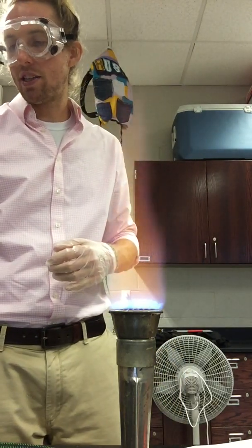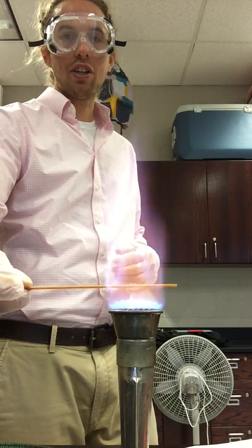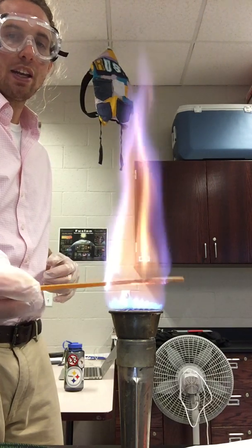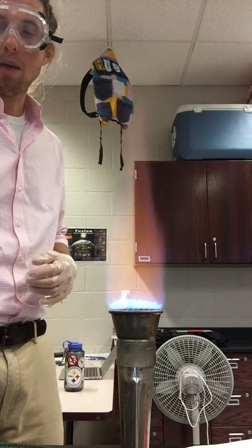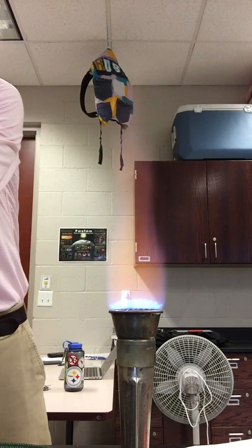So here is sample number 1. And we can see how that flame is changing. It's a bit hard to see. Maybe with that dark background you can see that's turning a bit violet in color. So again, kind of creative names, but it's maybe lavender, violet in color, and that is sample number 1. Moving along to sample number 2.